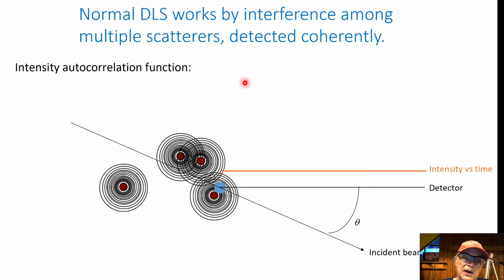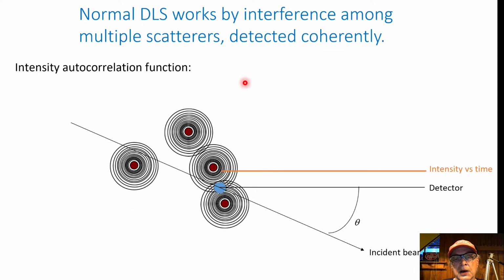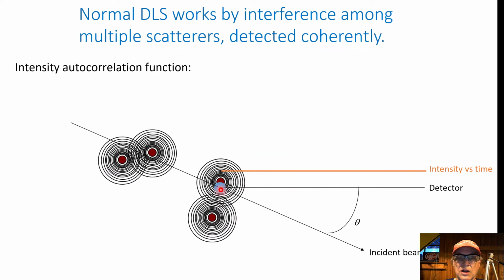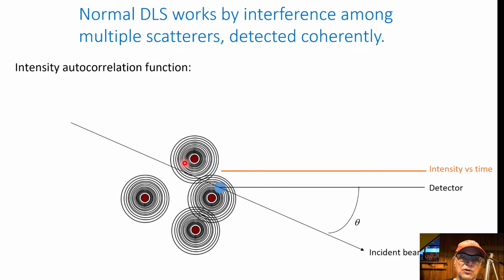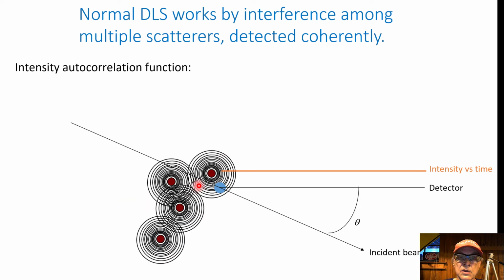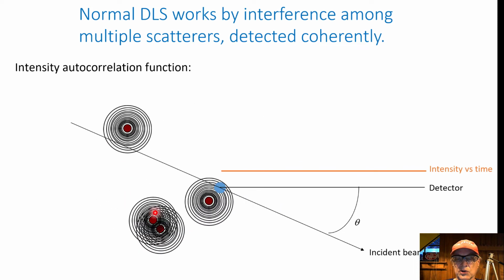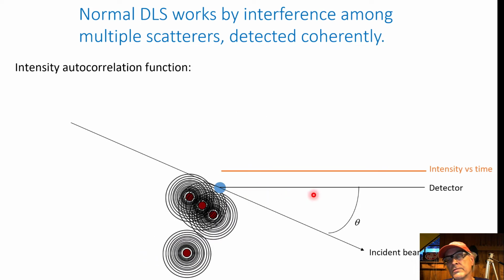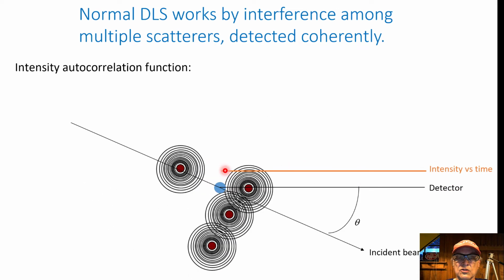You can see that they make kind of a moire pattern, M-O-I-R-E. But the overall light scattered towards the detector is constant. It's only in little regions where we see that interference between the scattered rays emanating from each of the 4 particles. Since we look at a large volume, a large area here, the intensity is constant. Okay, the intensity is just constant.